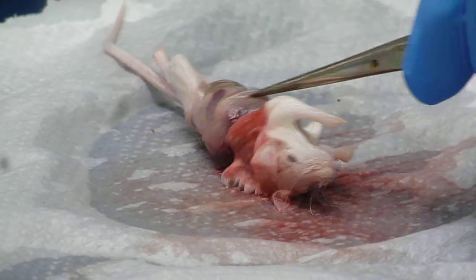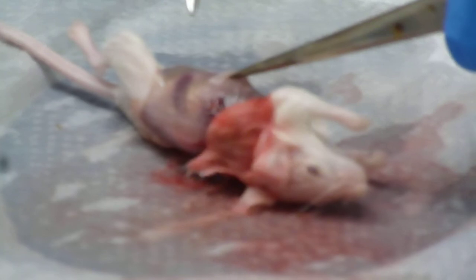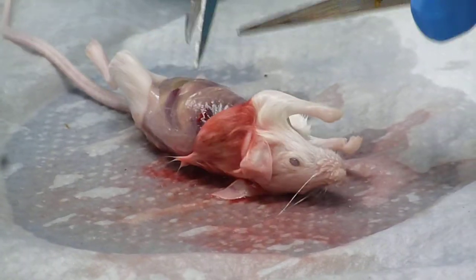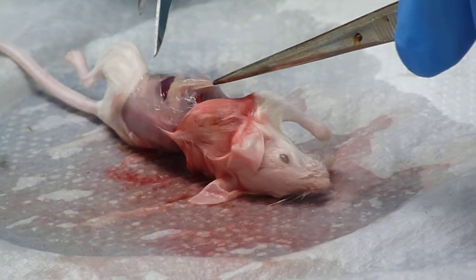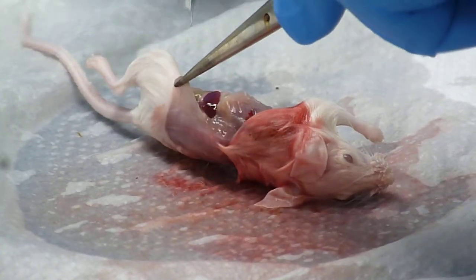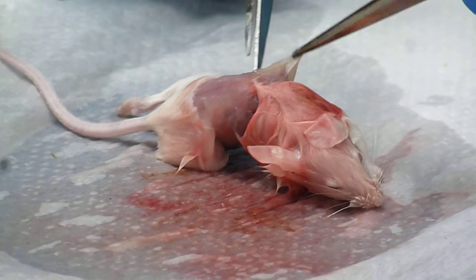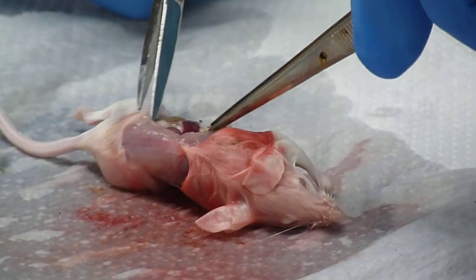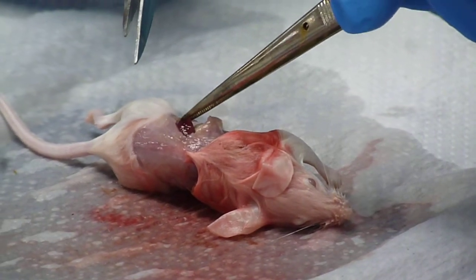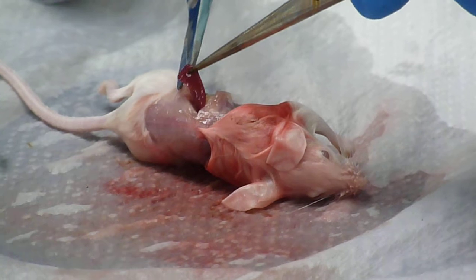So what we want to do — you see that kidney bean kind of shape right there? That's actually the spleen. I want to get that out. Essentially what we're going to do is cut through the peritoneal cavity, turn the mouse on its side, and then dissect out that spleen.